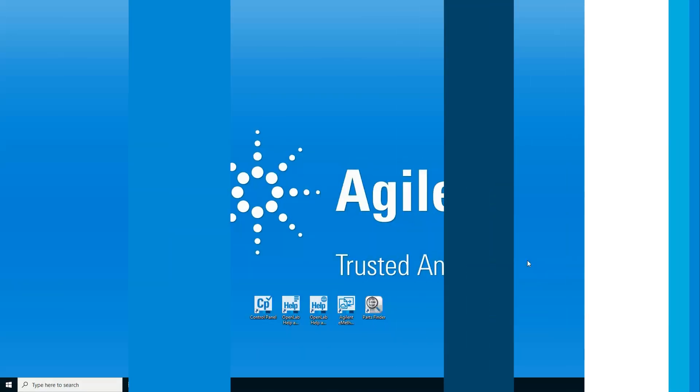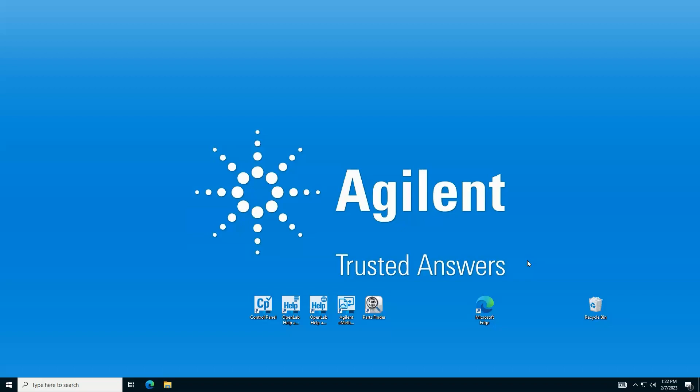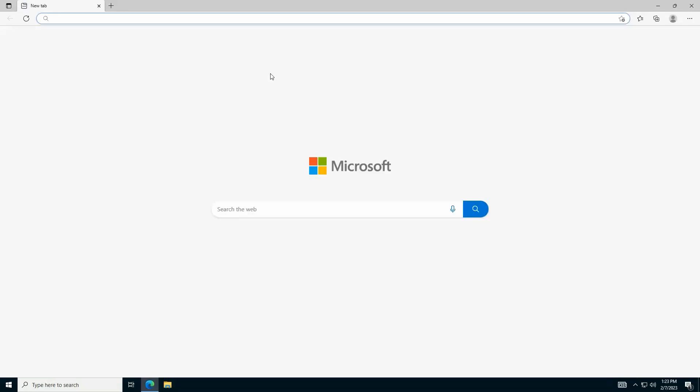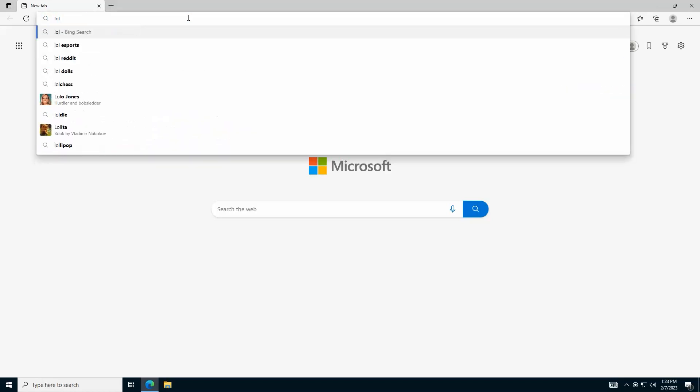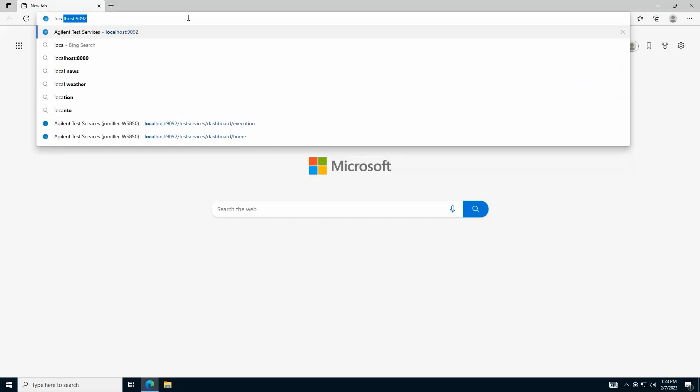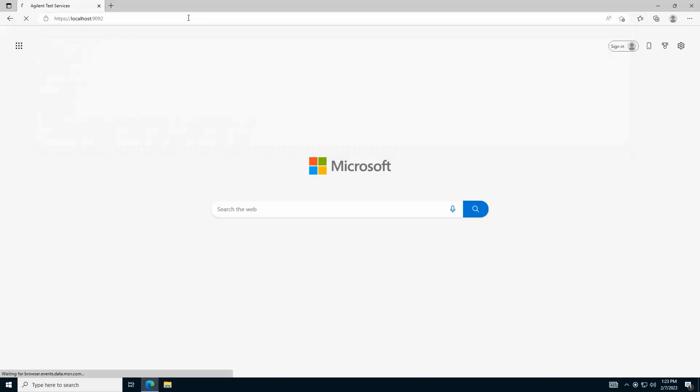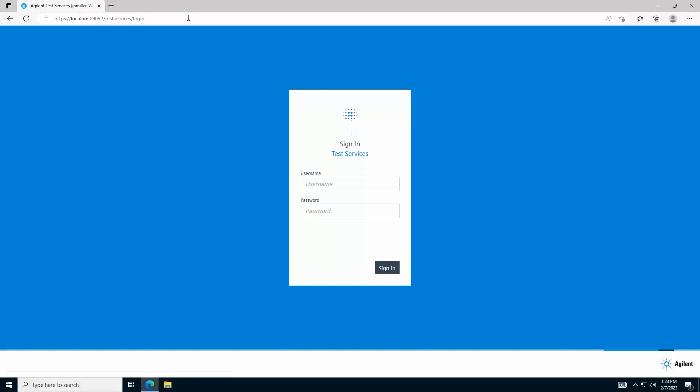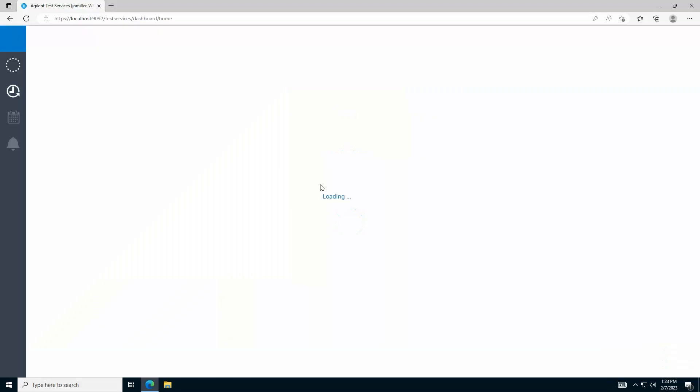You can get to Test Services using a standard internet browser. I'll use Microsoft Edge for this example. Browse to the URL provided by your system administrator to connect to an OpenLab CDS system on your network and enter the same user credentials you use for logging into OpenLab CDS to log into Test Services.